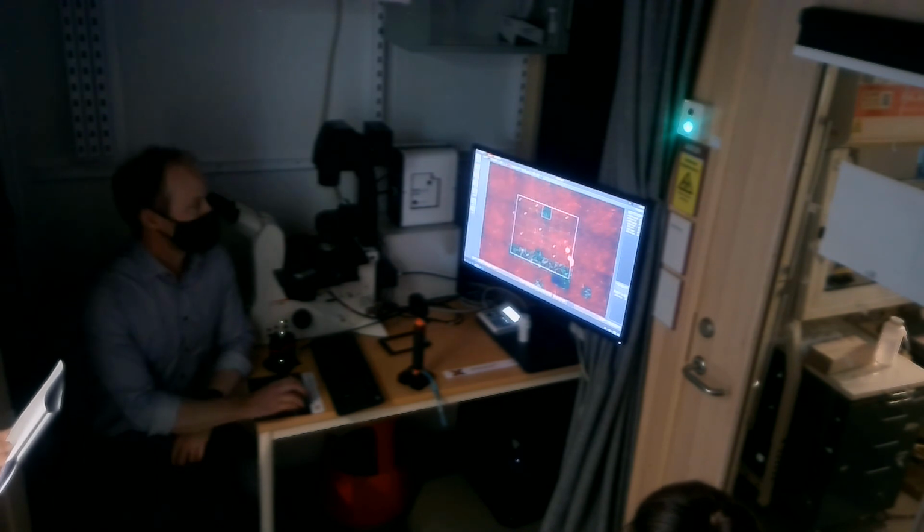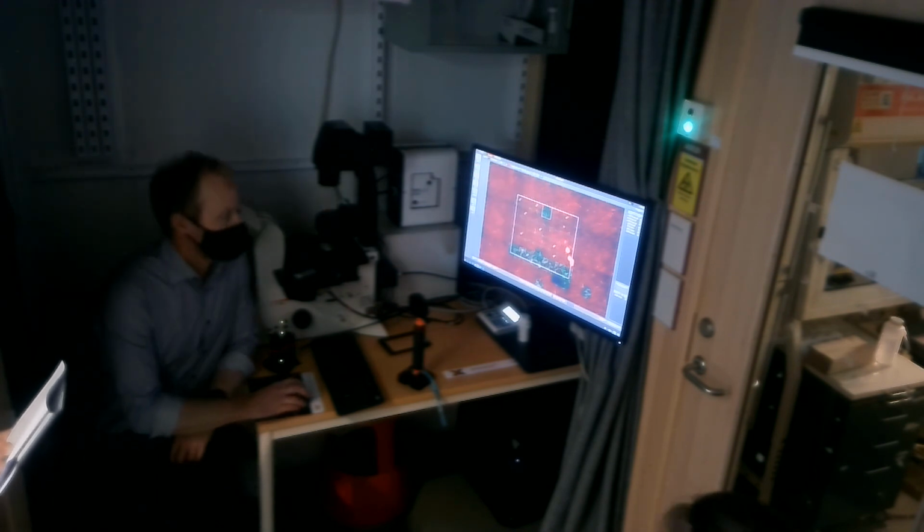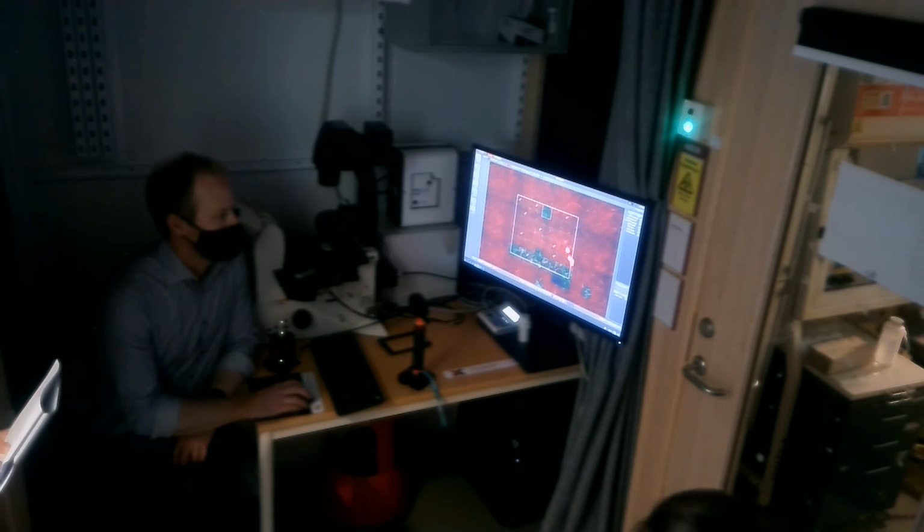But yes, with the autofocus job, it's always going to do it on the first channel in the row, so make sure you pick the correct channel for that. Okay?